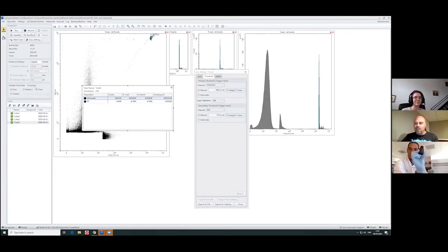And then there's lots of Apogee-type beads with multiple peaks and things like that. I just create my own because, like I said, the NIST beads come like milk and you dilute them. So I create my own curve of sizes just because I have them. I bought them, I have them. There you go. I just mix them together. Any of these are acceptable methods, but it's more of a quality assurance of the machine.